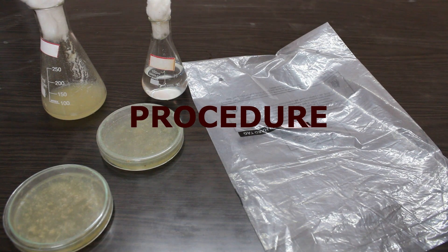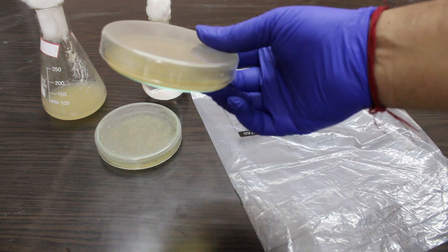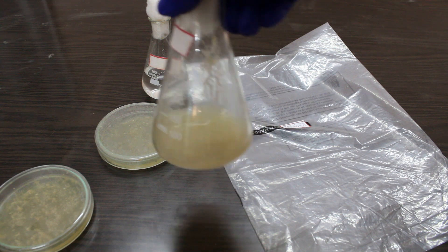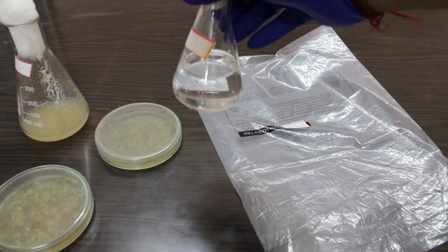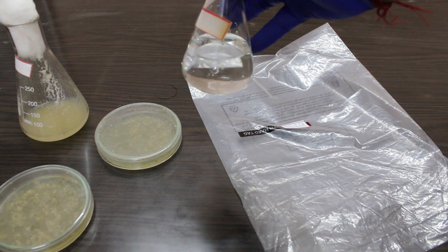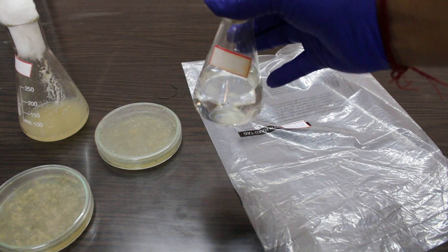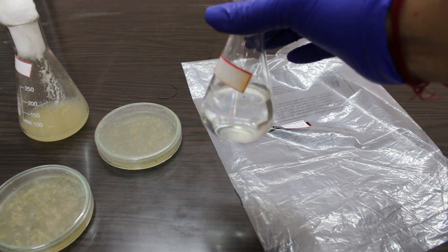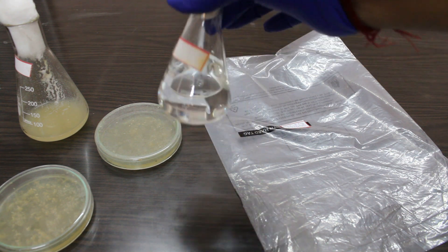Now coming to the actual procedure. These are all contaminated petri plates or petri dishes containing contaminated solid media. This is contaminated media in the flask. This flask is also contaminated but there is no media inside; instead it is filled with water, because we cannot place empty glass inside the autoclave machine — otherwise it will burst. Therefore it is recommended to fill the glass with some amount of liquid, for example water.